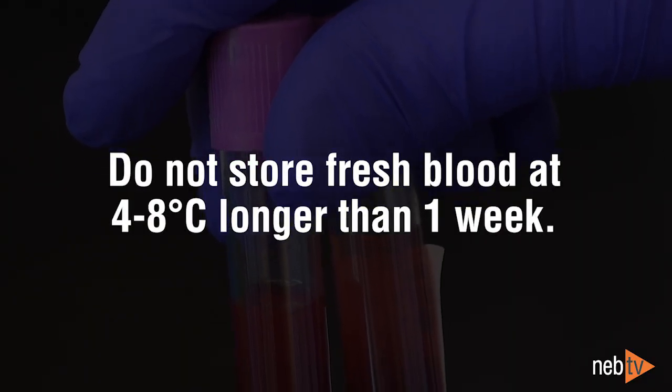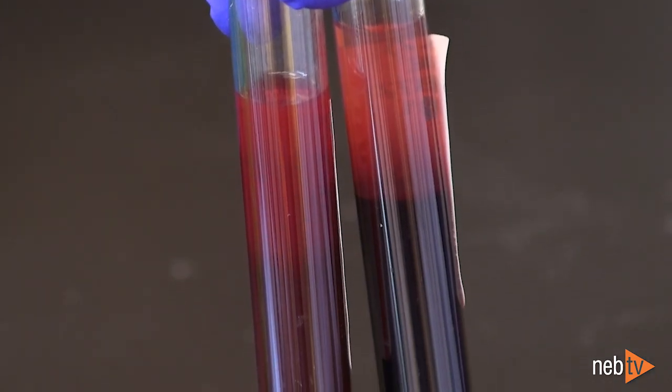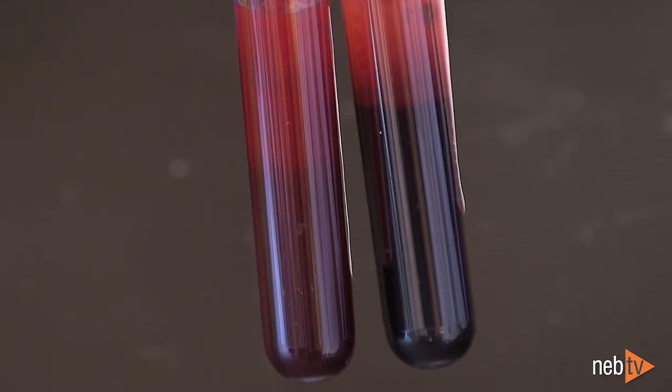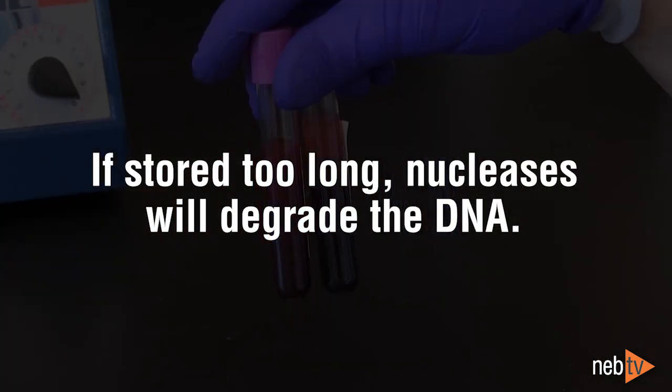Fresh blood samples should not be stored at 4 to 8 degrees Celsius for longer than a week. Plasma of whole blood is rich in nucleases, which are kept in check as long as leukocytes remain intact. When stored at 4 degrees Celsius for too long, the leukocytes become unstable, and nucleases will degrade the DNA.